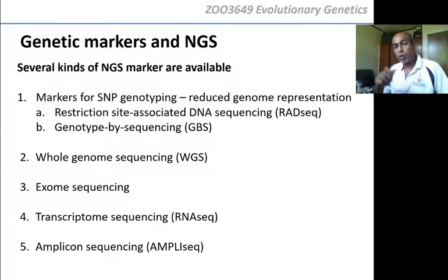So what do you have to do? You get DNA from those hundreds or thousands of individuals, you extract each one, and then you do a PCR on each one using the same primers, right? The same 2 primers for all the PCRs. And then what do you get? You get an amplicon, a PCR product for each sample, and then you put them all together and send that off and say, okay, sequence everything that got amplified. You give each sample a barcode, and so when it gets sequenced and comes back, you can tell barcode blah blah blah was sample 1, barcode blah blah blah, which is a sequence, is sample 2, and so on and so forth.